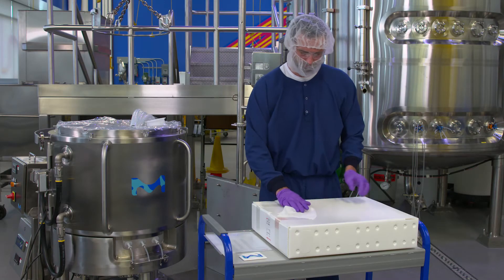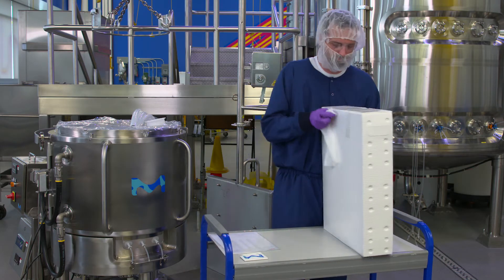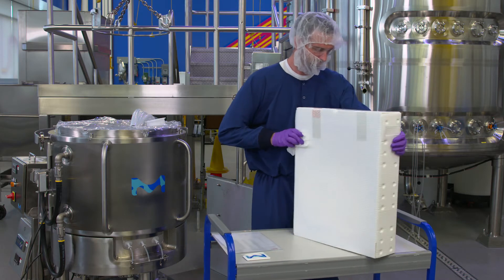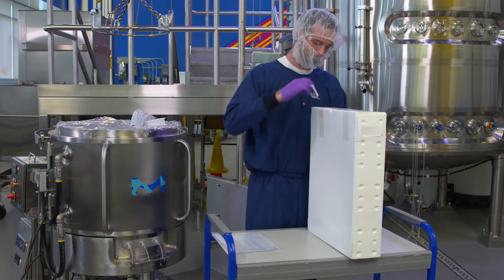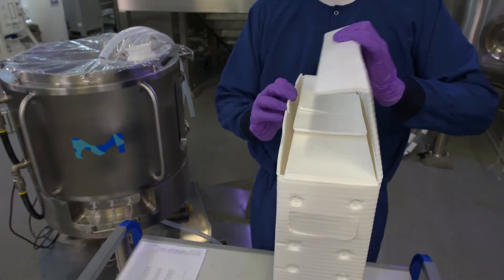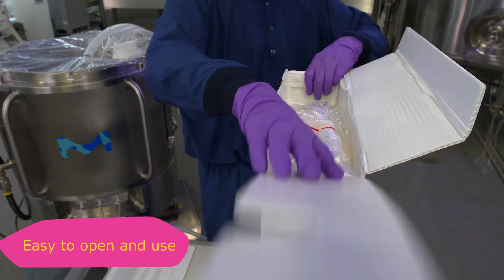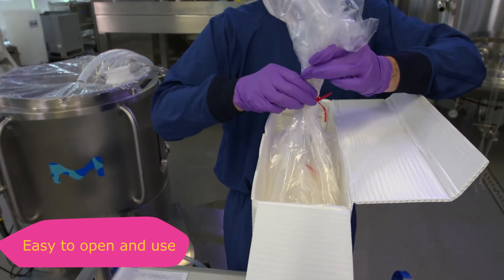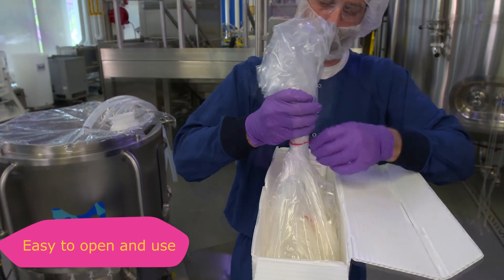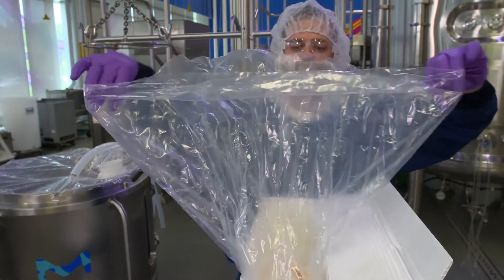The EZ Biopak Bag is manufactured with a single layer of ArmorFlex 114, a linear low-density polyethylene film chosen for its purity, strength, and elasticity, meeting all required regulatory compliance standards. The pre-weighed dry ingredients are dispensed into the top of the EZ Biopak Bag. The bottom of the bag is the connection for your vessel and is a clean connection, as powder does not go through the connection until it is at your site.